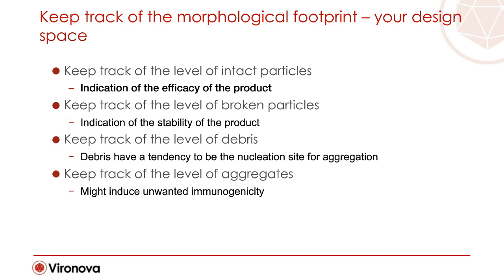So back to you, Josefina. Thank you, Martin. I will now focus on how to analyze the adeno-associated virus particle, as we have seen a growing interest in using AAV particles for gene therapy.